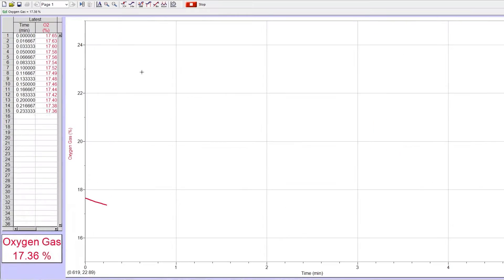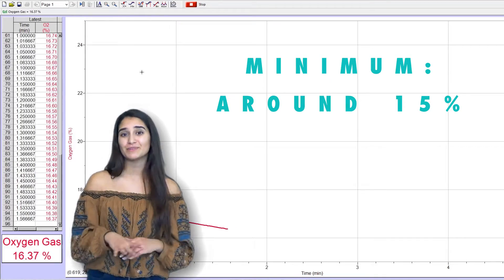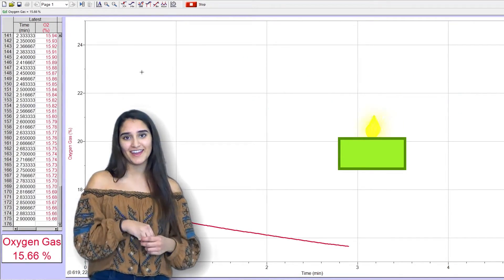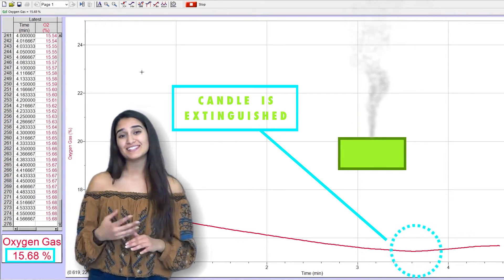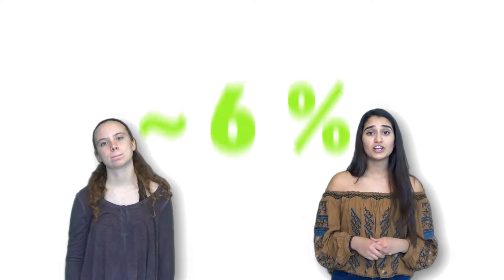There are a few things to note before watching this video. This method can only lower your oxygen concentrations to a minimum of around 15%. The whole process revolves around a candle burning out the oxygen in the air, and the candle actually puts itself out around 15% oxygen concentration. This being said, it still allows for around a 6% change in the concentration, which can generate significant effects in a multitude of experiments.